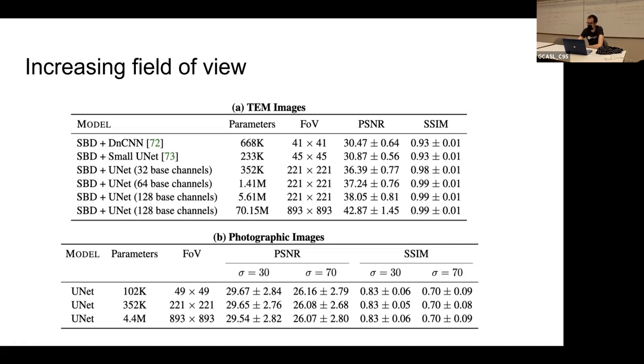A very good question. The motivation here was asking why this is suddenly making a big difference, whereas for natural images it actually does not. The answer is probably because the important features in natural images are not so periodic, so you don't need such a large field of view to see them. And also the noise is not as high.